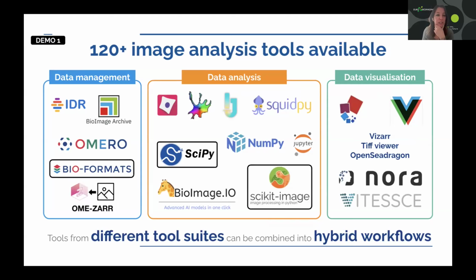So today we will see that Leonid will cover the automation of workflows here using Bio-Formats, SciPy and scikit-image as well. And then Ricardo will cover more the data management part with OMERO and the BIAFLOWS visualizations.